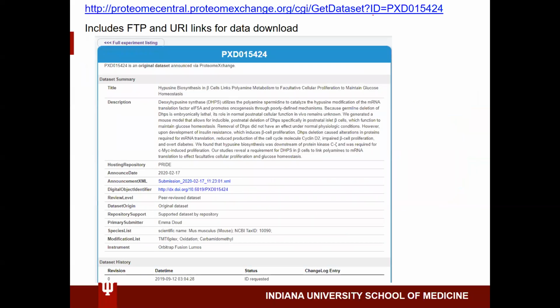So after you have sent in your data and created an upload submission, you will receive this PXD number, and that is included in your manuscript usually, and it's this original data set. So this is an example of an upload which I did late last year, and then made public in February.